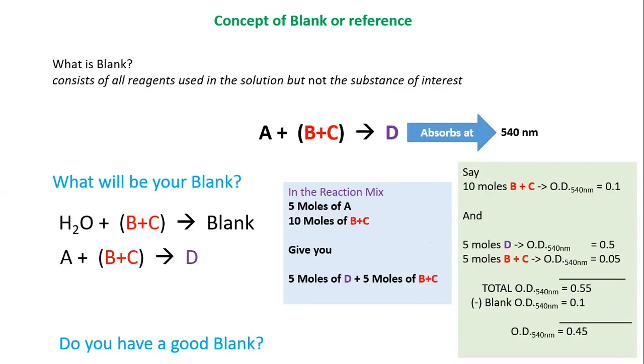So as Pooja said, she at least tried, but I would like to first find out what did you try, Pooja, in order to figure out that if this is not a good blank, then how you can prepare a good blank? So whether we will take a blank for each sample test tube separately. Correlate it with what you do during your practicals. Okay, do you prepare a separate blank for each tube, or do you prepare a single blank?